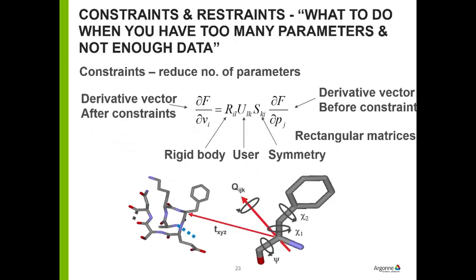All right. Next bit that goes into a Rietveld refinement is constraints and restraints. And the problem here is powder diffraction data is limited because of the overlaps. And if your problem is too complicated, a bit excessive, but like a protein, you have to add additional information in the form of constraints or restraints.